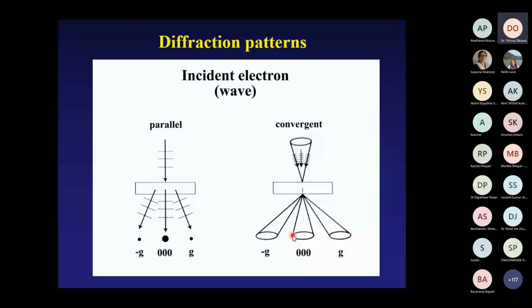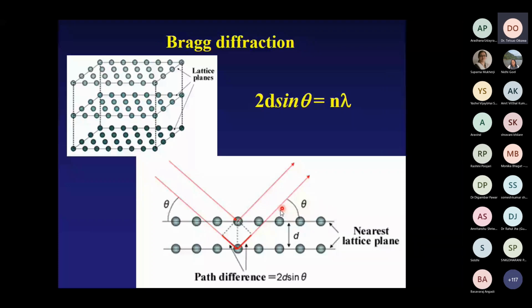The electron diffraction principle is exactly the same as Bragg reflection for X-ray diffraction. With the lattice spacing, the D-spacing, the electron wave is deflected and enhanced at a special angle, incident angle theta and exit angle theta, depending on the D-spacing. A strong electron beam is enhanced in the Bragg reflection condition.